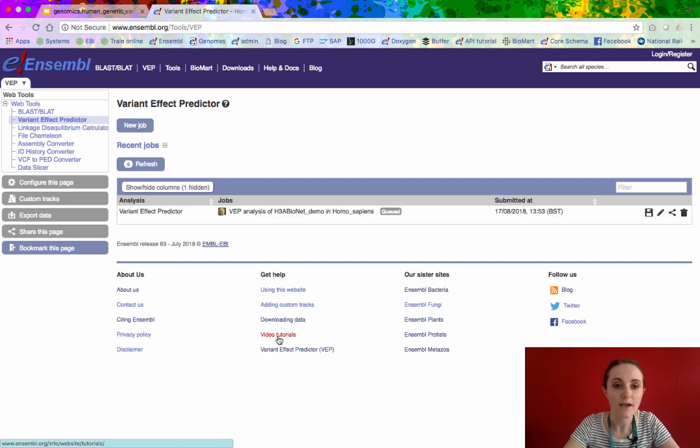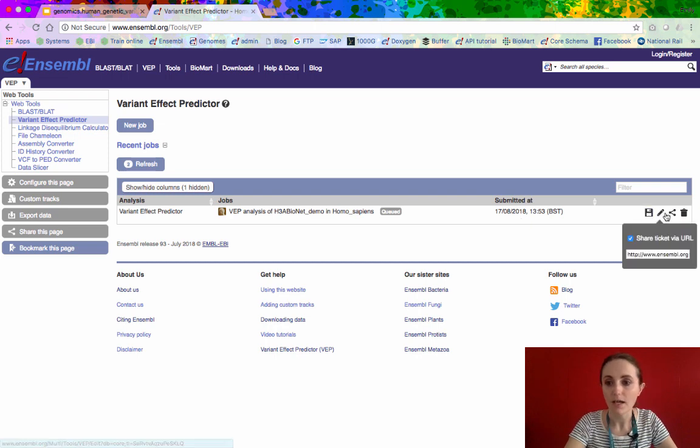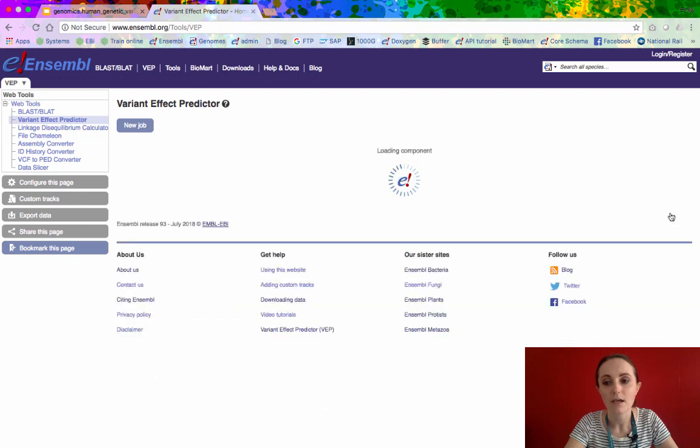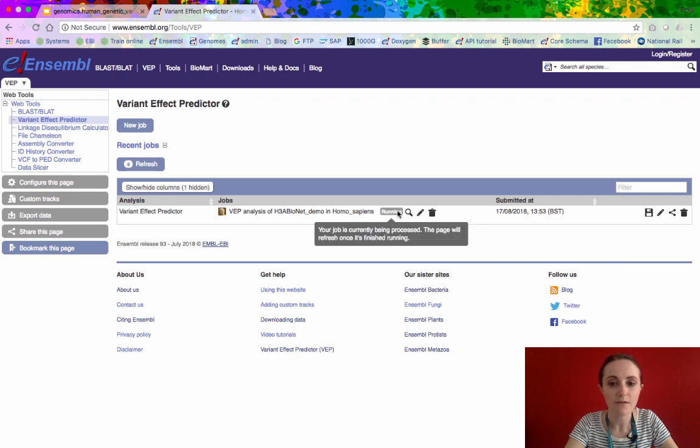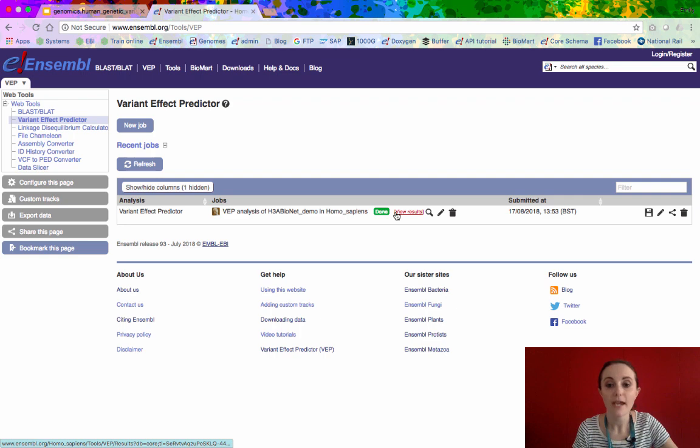So this refreshes every 10 seconds. You'll see this is my job here, the VEP analysis of H3ABioNet demo in Homo sapiens. I can save this to my account if I want to. I can edit it, and I can also share it, so I can send this link out to anybody who I want to see my data. You see that it's currently running, and this keeps on refreshing, and eventually it will tell us it's done. Okay, now it says done.